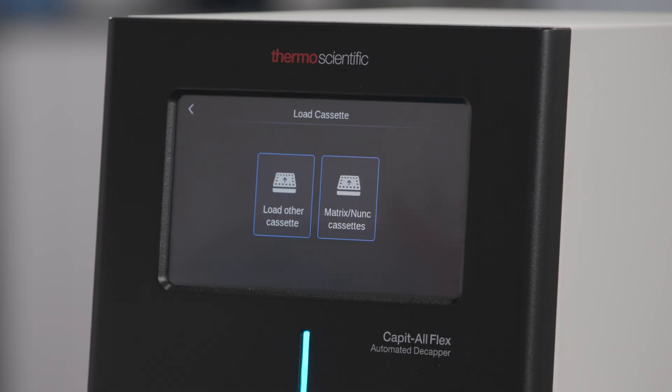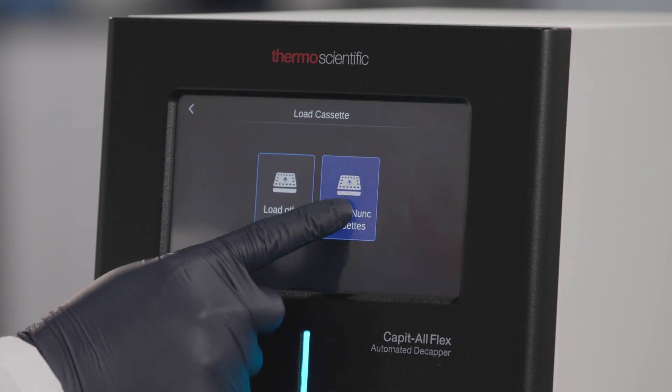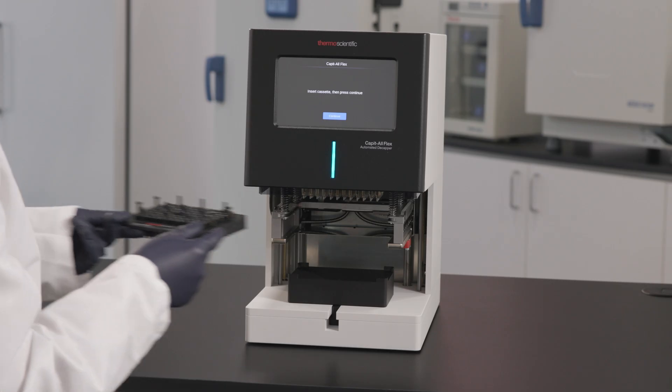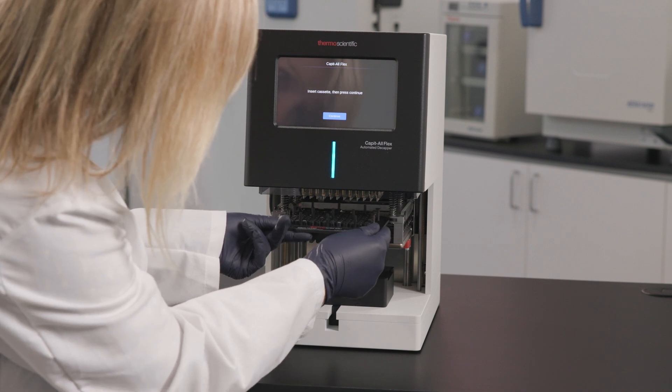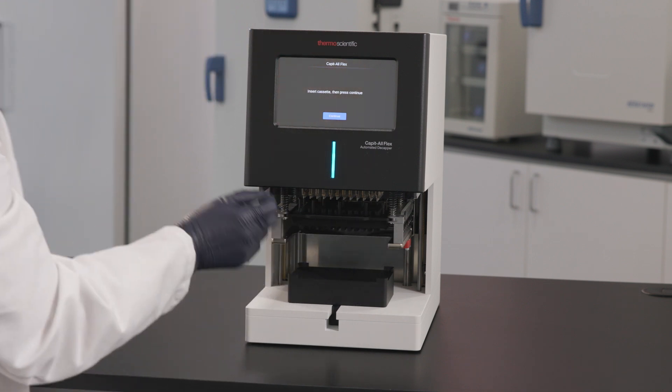Select the Load Cassette button to install the cassette. You will be given the option to choose between a Matrix or NUNC cassette and any other cassette type. If you choose Matrix or NUNC cassette, simply insert the cassette with the tab facing forward, then press Continue.